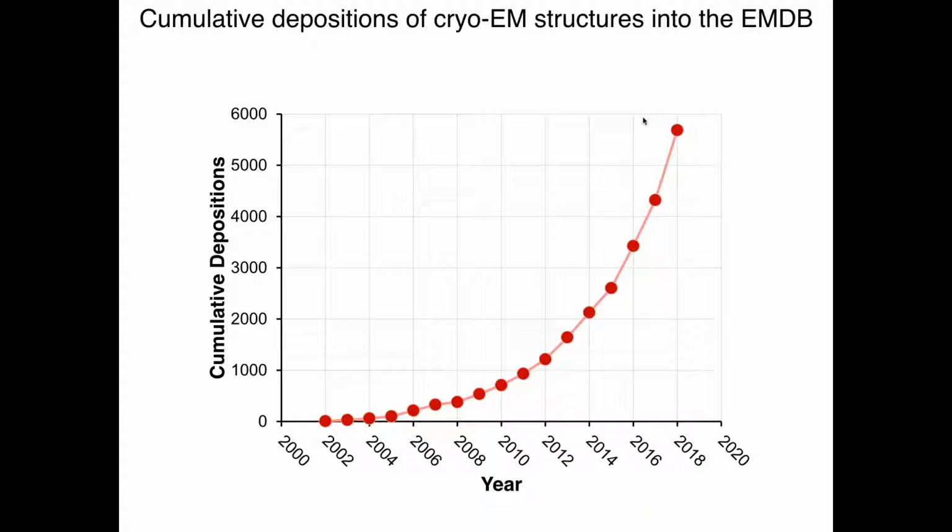This also led to a rapid increase in the number of cryo-EM users and practitioners. This is just a plot showing the cumulative depositions of cryo-EM structures into the EMDB, with some inflection points around 2013, 2014, and now it really is going up and up.